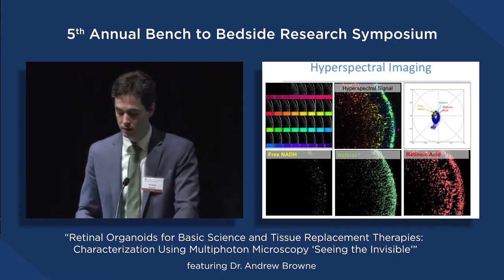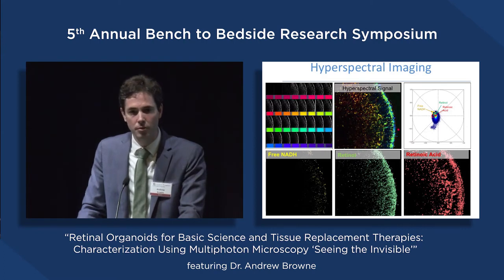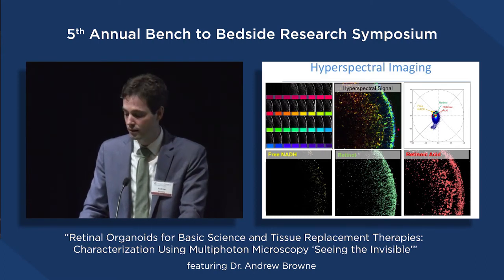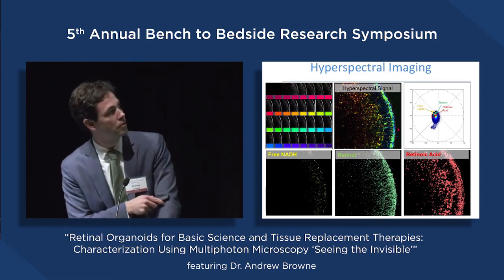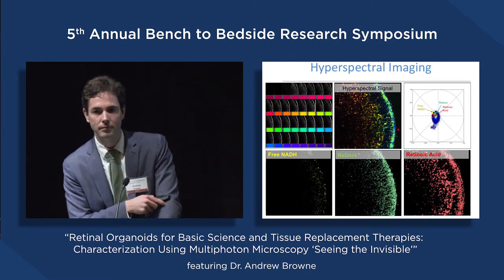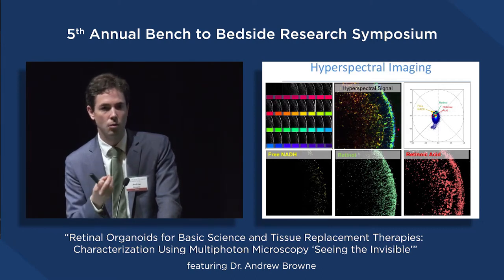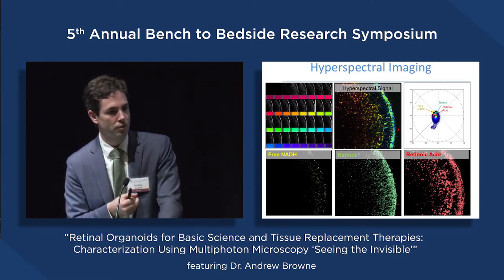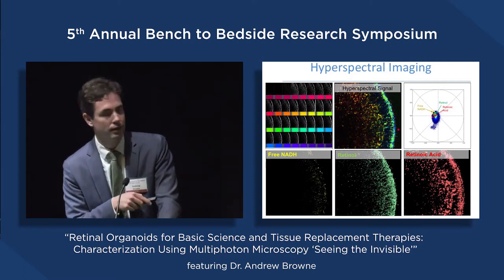the colors into different channels, so 32 different channels, and then perform a similar approach using phasor analysis, again, developed between the 2 groups here and at USC, to look at where are retinol and retinoic acid located. So again, not even touching the tissue, just shining light on it and letting it glow and tell us where are subcellular constituents within the cells. And so we can actually plot out where are retinol and retinoic acid.